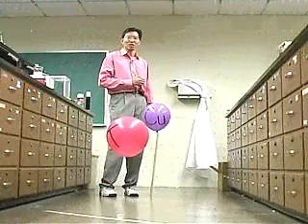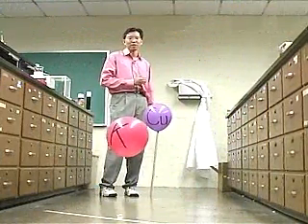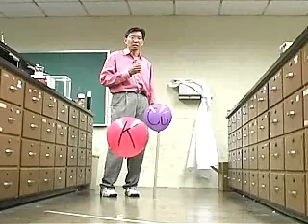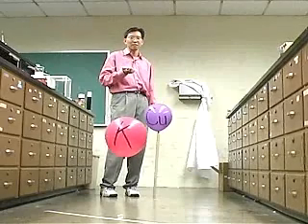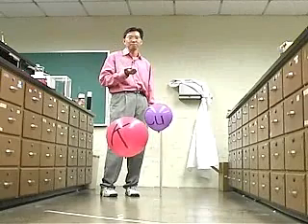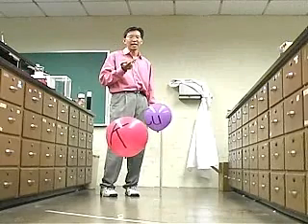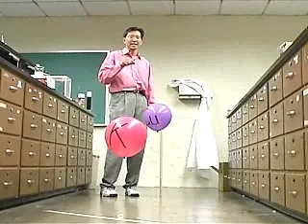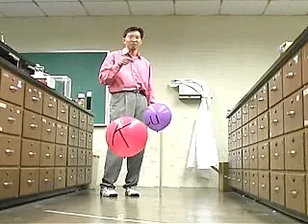Have you ever wondered where all the pretty colors in fireworks come from? Basically, the idea is this. You need an exothermic reaction, like, for instance, gunpowder exploding. Gunpowder is potassium nitrate, sulfur, and carbon. And that reaction fuels another reaction. It is the electronic excitation of metal salts.